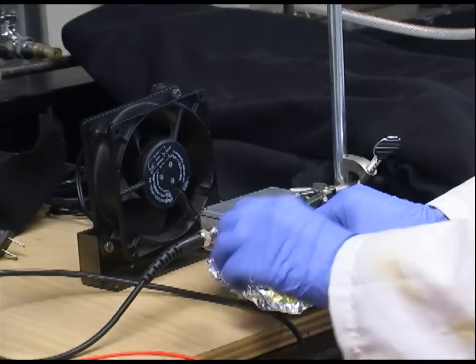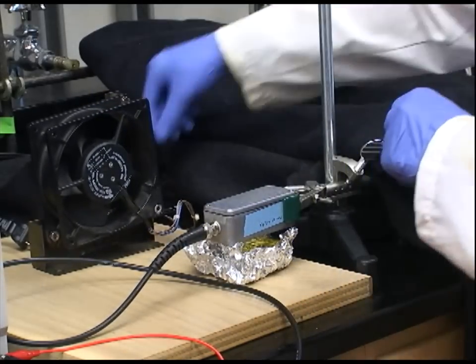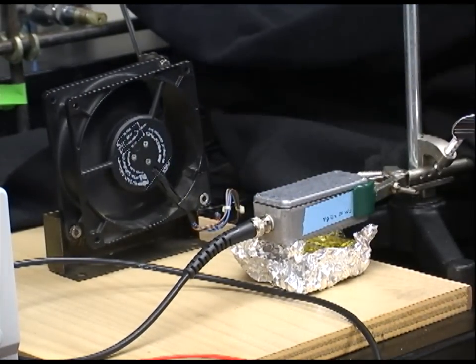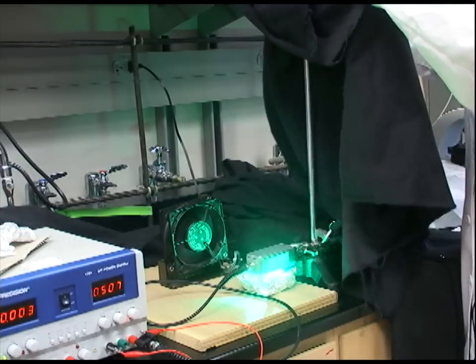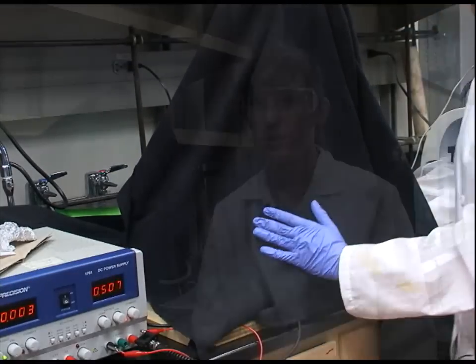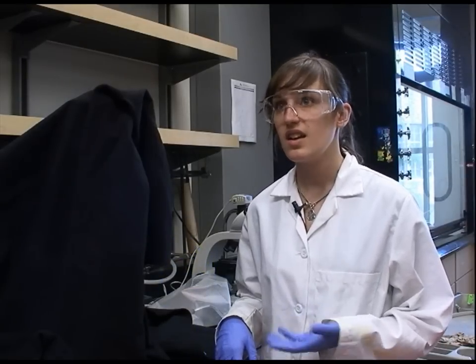After the pH adjustment I take the seed solution and put it under an LED. I wrap it in tin foil to redirect as much light as possible onto the solution and place it directly under the LED, running at about its maximum current, then cover with a black cloth. The conversion time from silver nanosphere to prism will depend on the wavelength of light used, but for most wavelengths it takes approximately 12 to 24 hours.